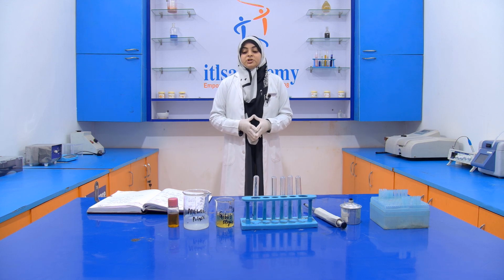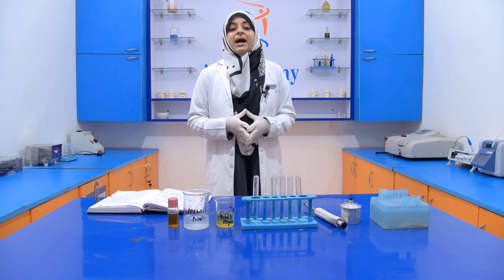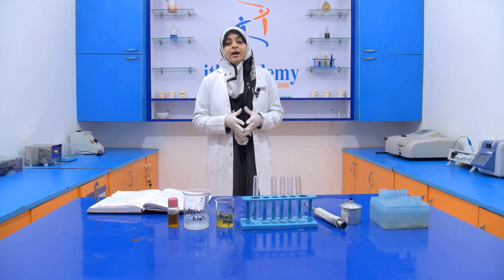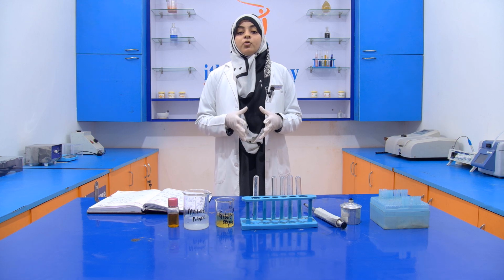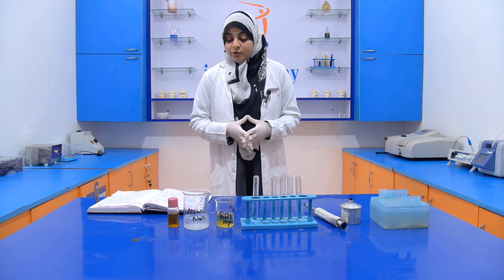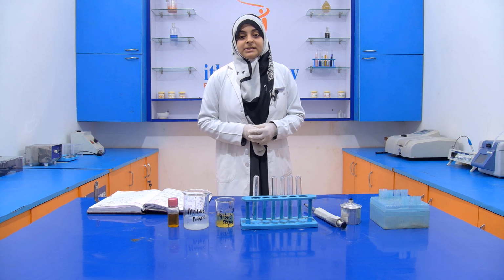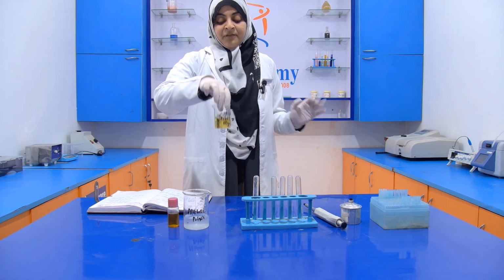Now the second reagent is Gibbs reagent, that is also known as dichloroquinone chloroimide solution. For this we require a chemical known as 2,6-dichloroquinone chloroimide, 1 gram, and it is dissolved in 200 ml of absolute ethyl alcohol, and then we keep it at 10 degrees Celsius, and this solution is only used within 5 days.